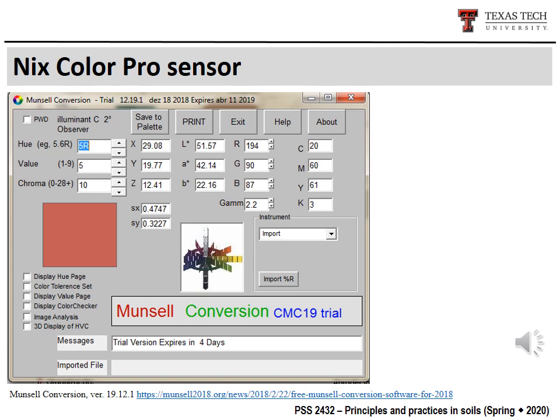For example, LAB, RGB, CMYK. You can export the color. It's very interesting to convert the color systems. All right, you can try.